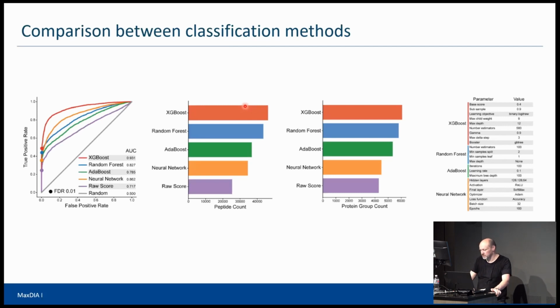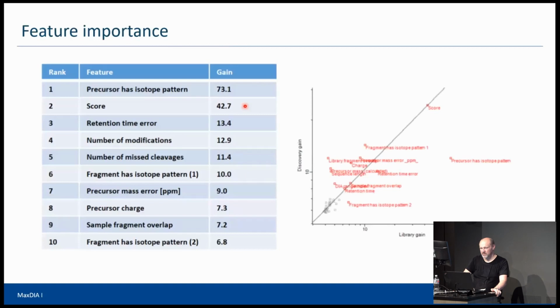Okay, so let's go ahead. Now the XGBoost is running, and it's done with cross-validation. What it also gives you is a measure for the importance of the different features. As a help to interpret the prediction, it can tell you which features were important for this decision and which were not so important. It's one number, called gain, and you can sort your features by this gain number.